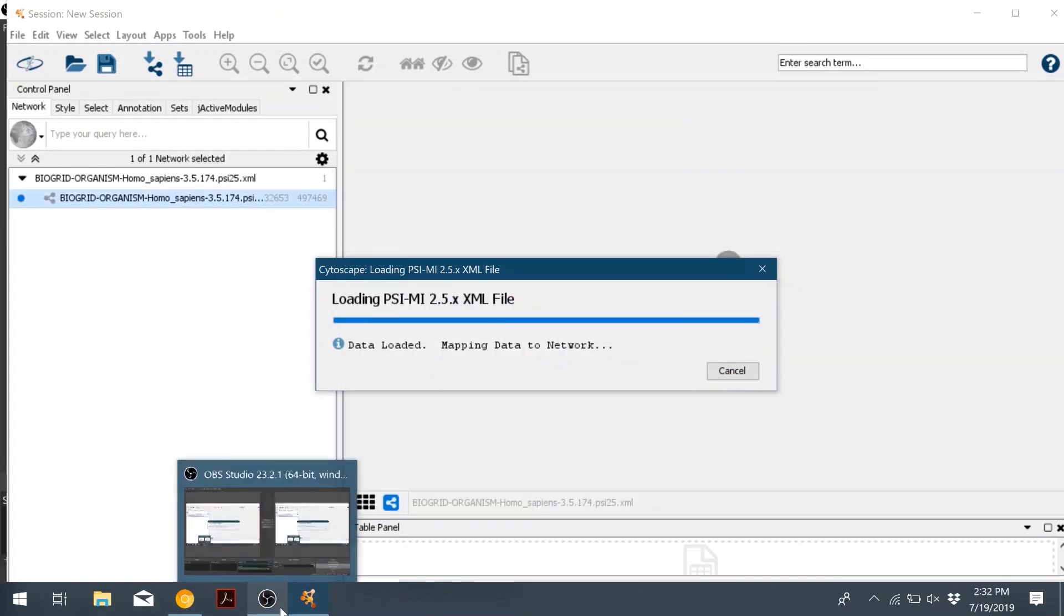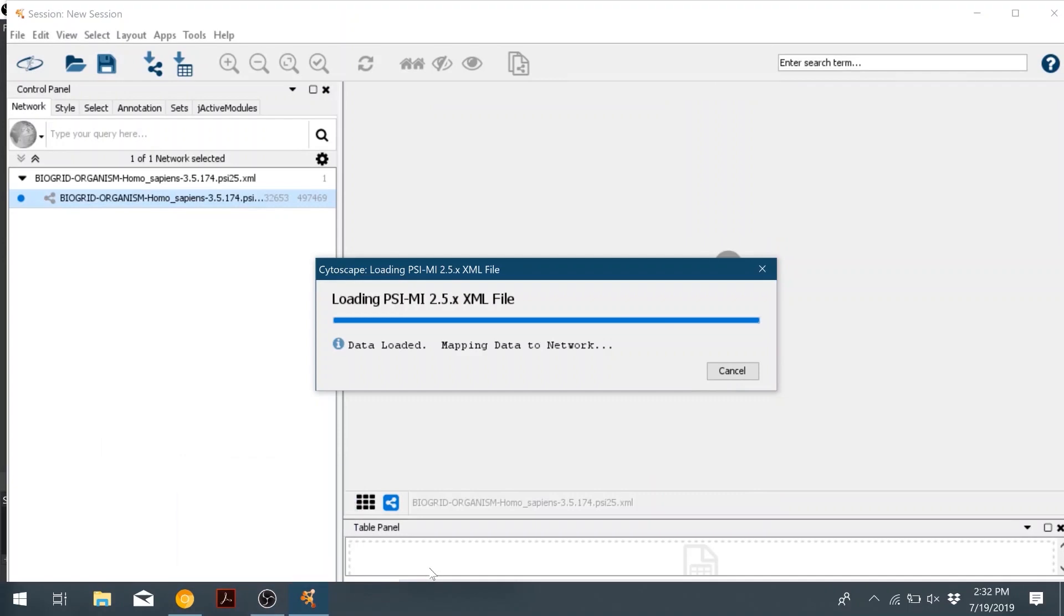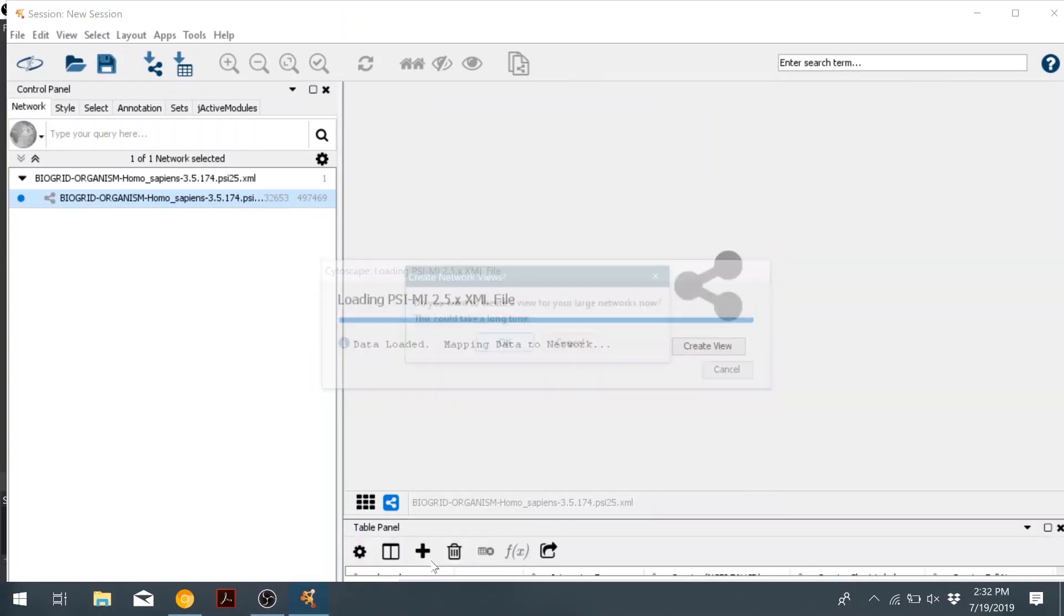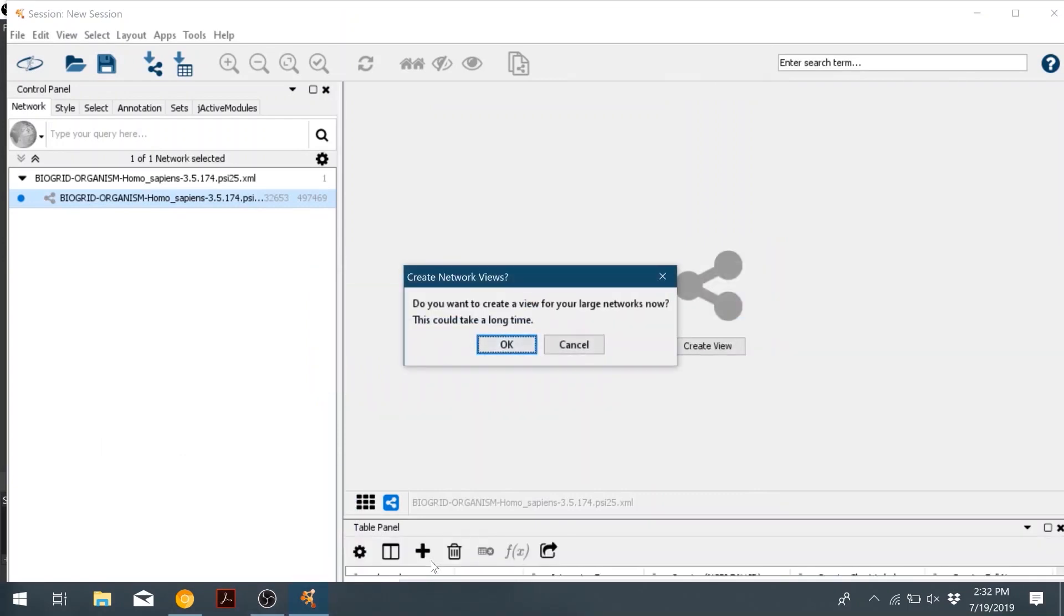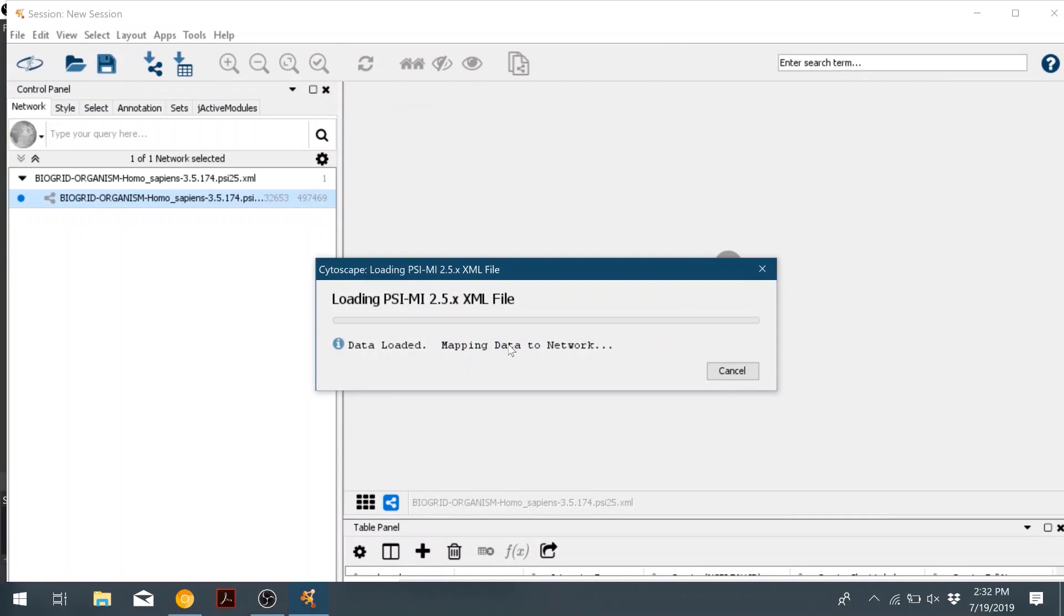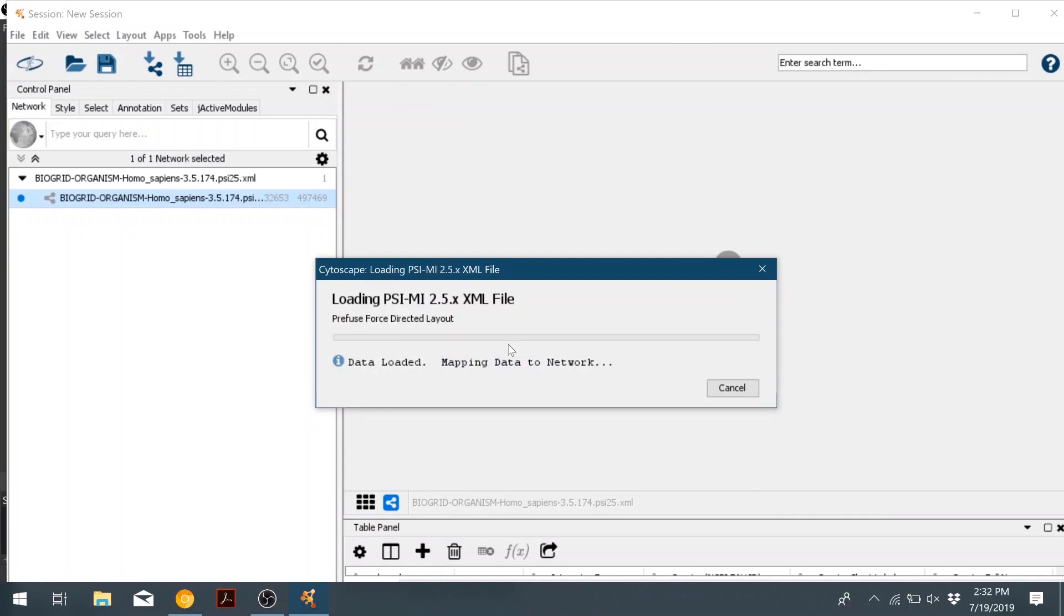Once Cytoscape has created the network, it will then ask you if you want to create a network view. We're going to click OK, and then this step also takes a very long time.